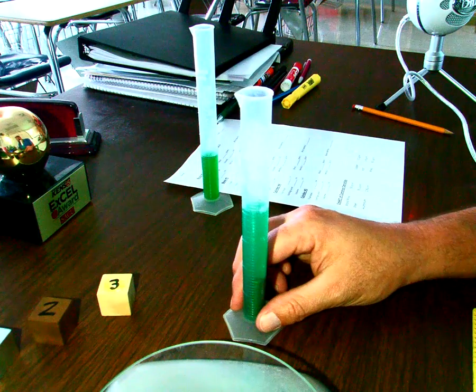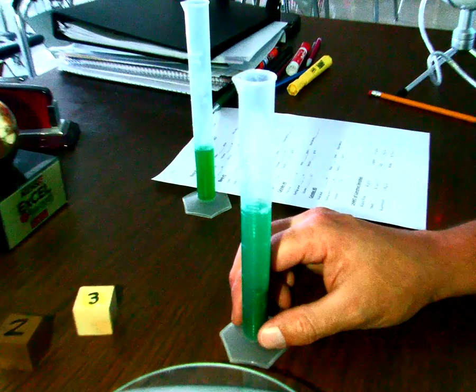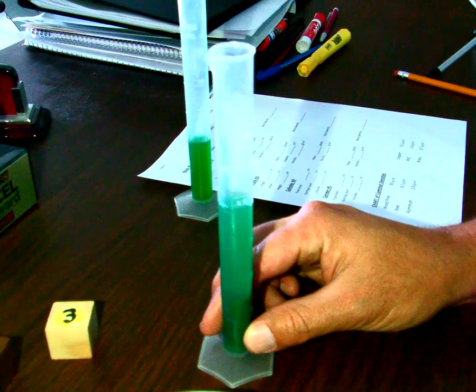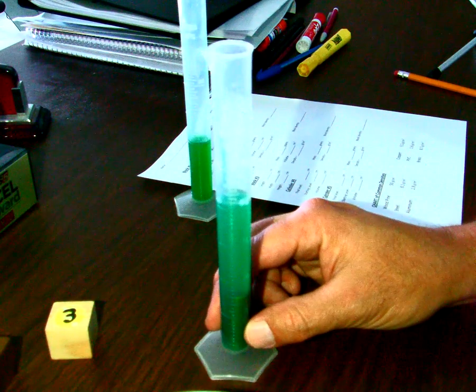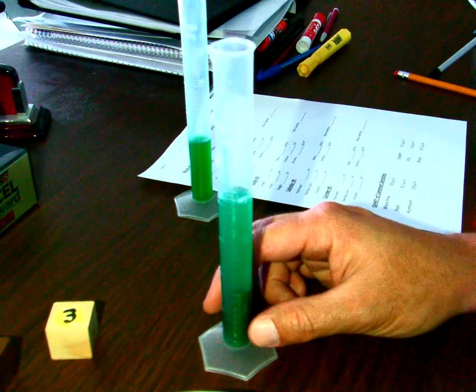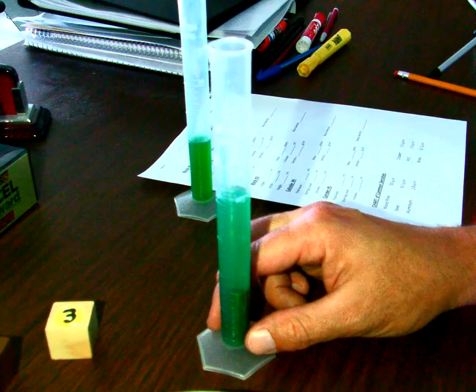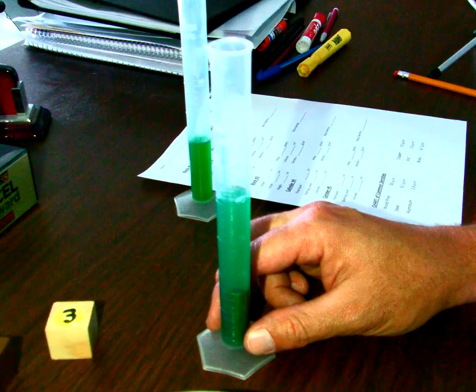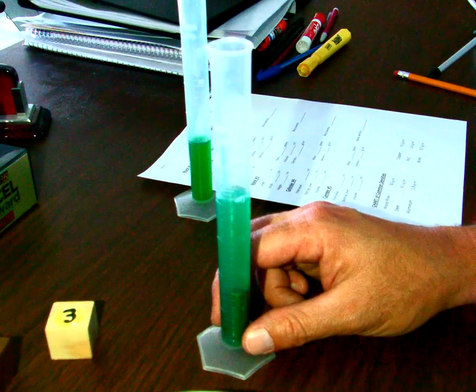All right, so we have a new volume. I'm going to zoom in to see if you guys can see that any better. It may be kind of difficult to read. In fact, it is difficult to read. I'm looking at the screen now. So I'm going to give you the reading, and it went from 15 milliliters to 20 milliliters. So our initial volume, or our starting level, for cylinder number 4 was 15, and our final level is 20.